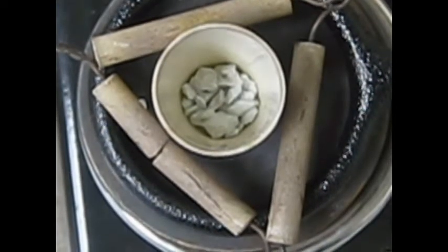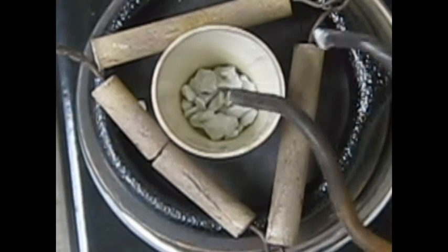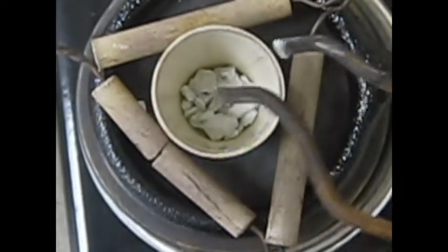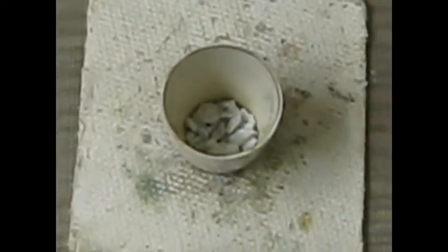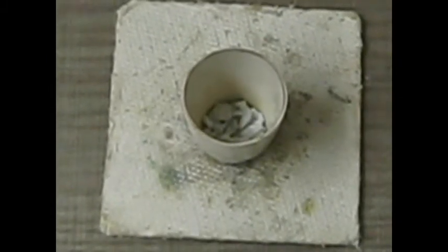Okay, it looks good. I see all the blue is gone. So now I'm going to take it off. And normally we would let it cool for 4 minutes, but I'm a little pressed for time because I'm making this video a little before class.